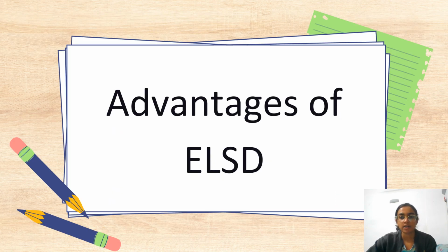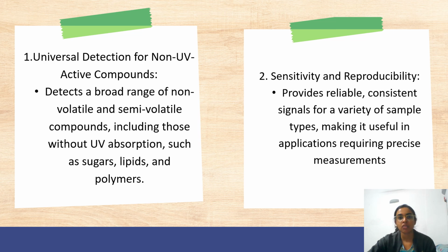Let's see the advantages of ELSD. Let's start with the advantages of ELSD. First is the universal detection for non-UV active compounds. It detects a broad range of non-volatile and semi-volatile compounds, including those without UV absorption, such as sugar, lipids, and polymers.